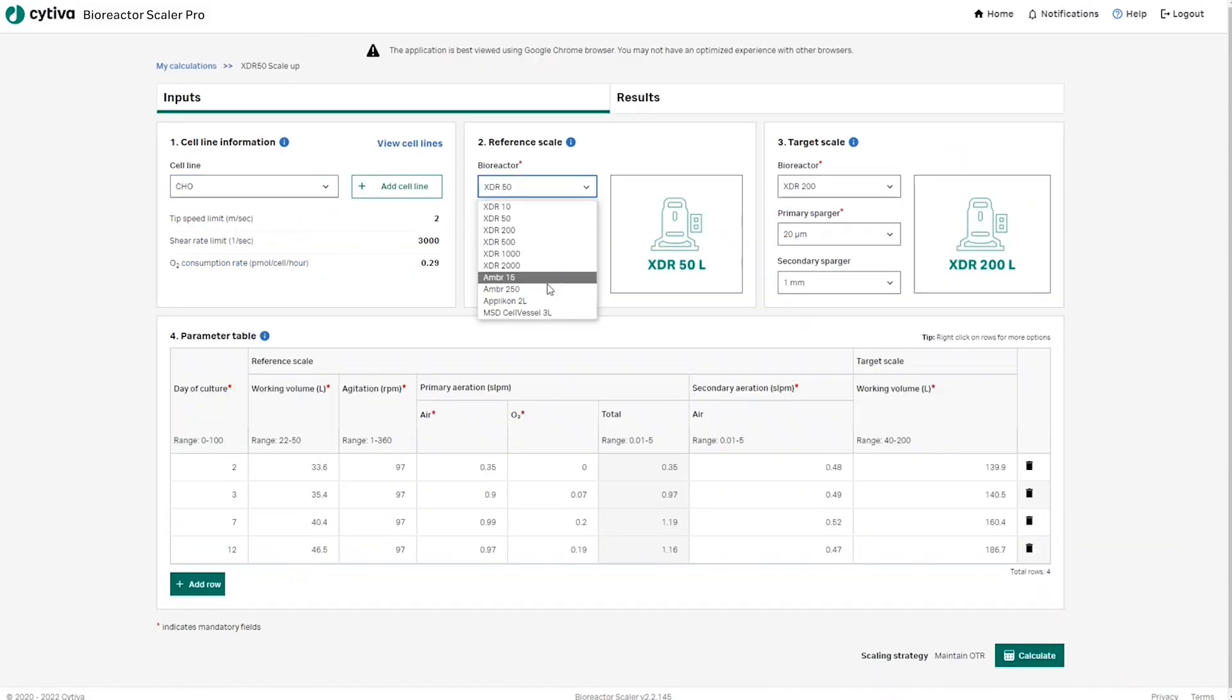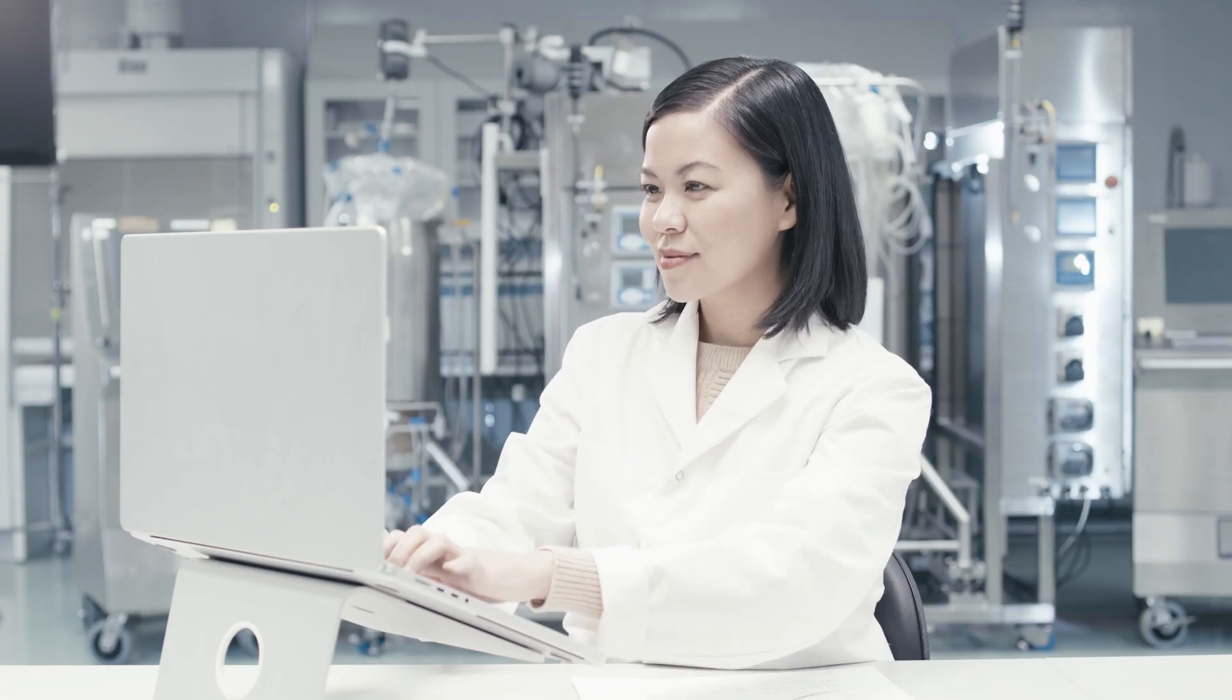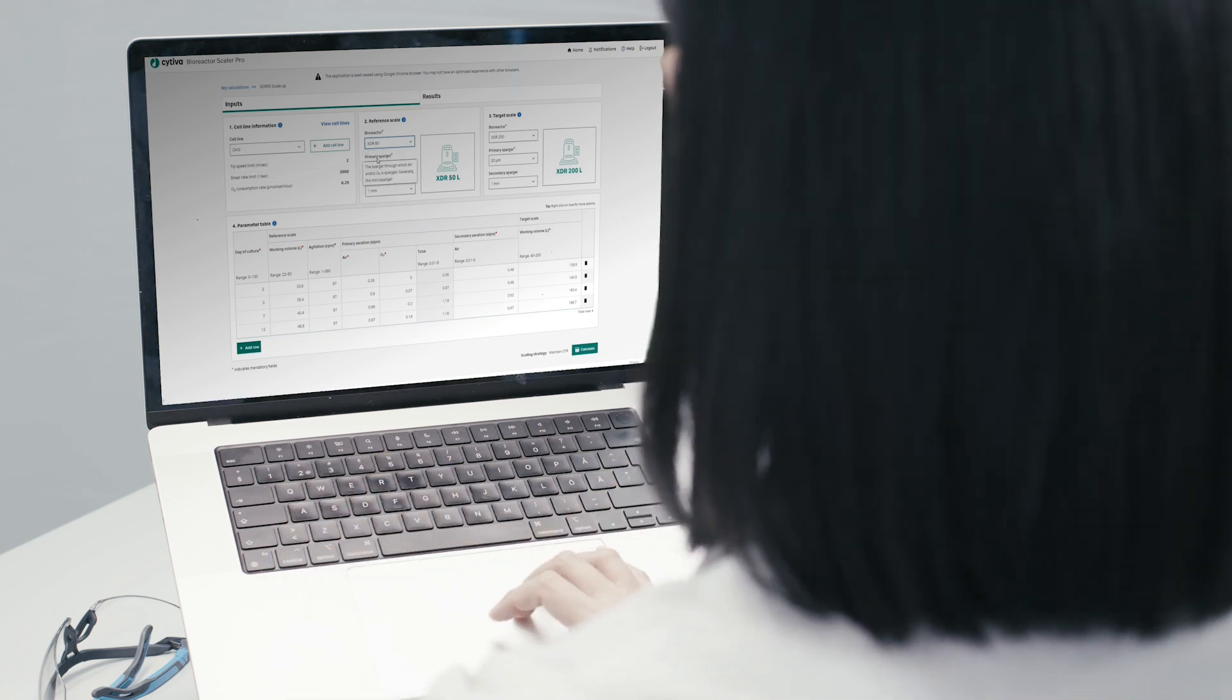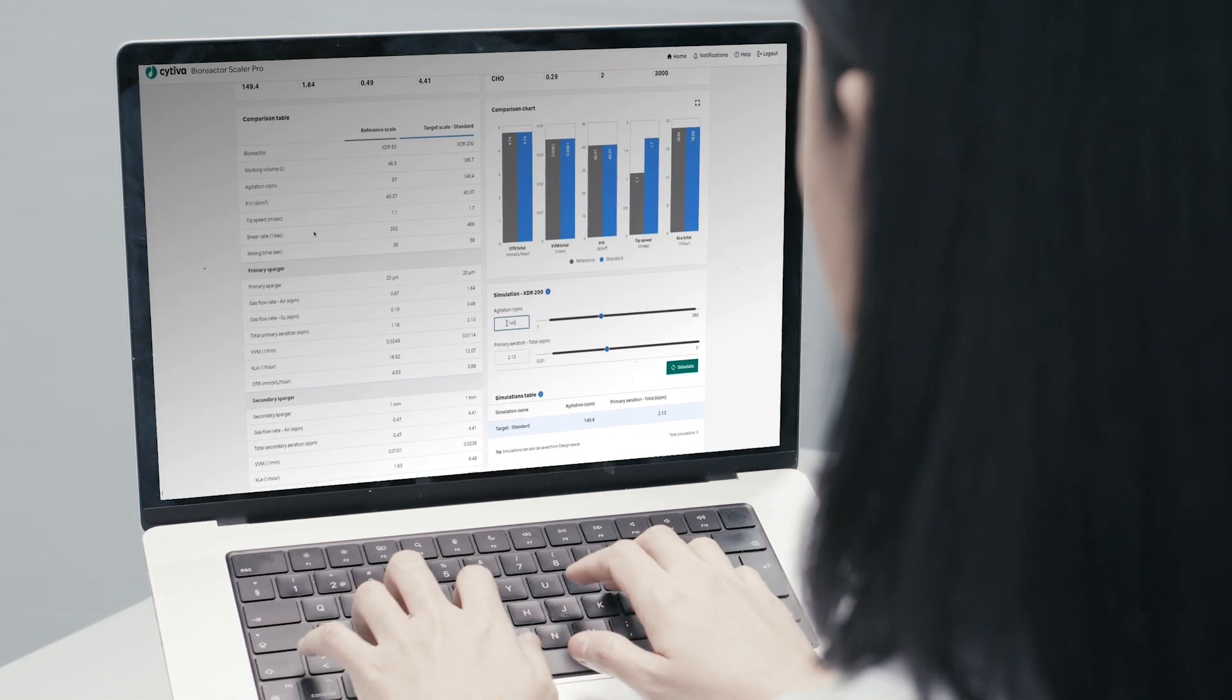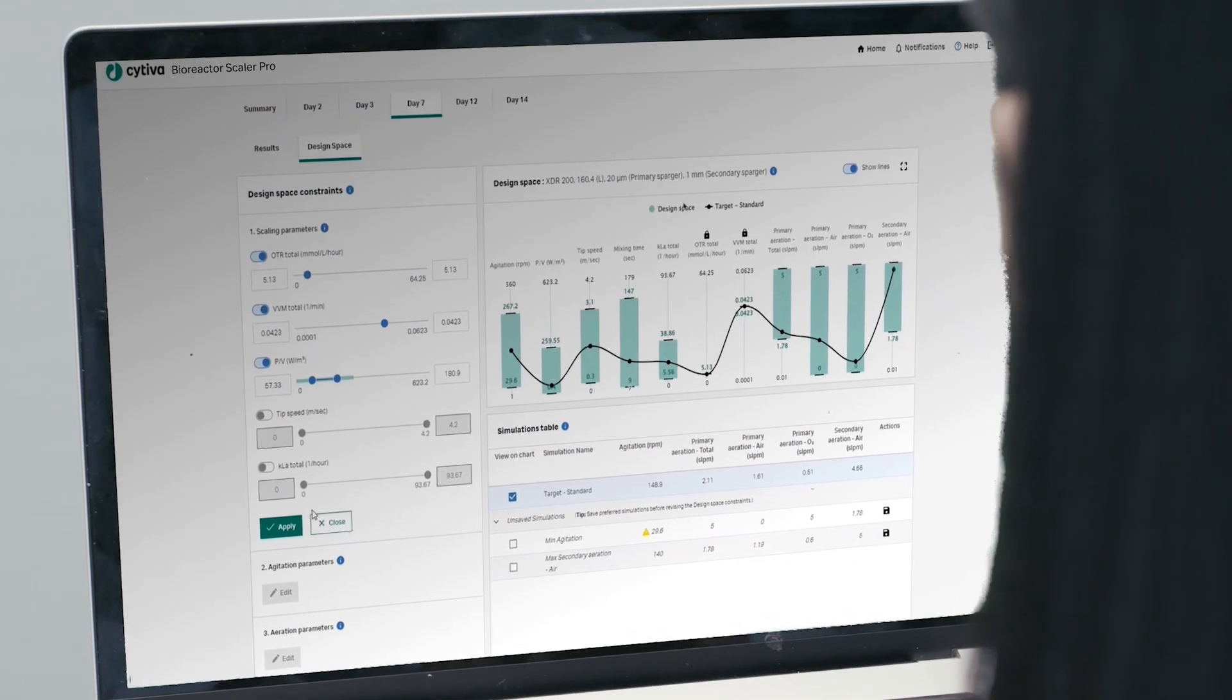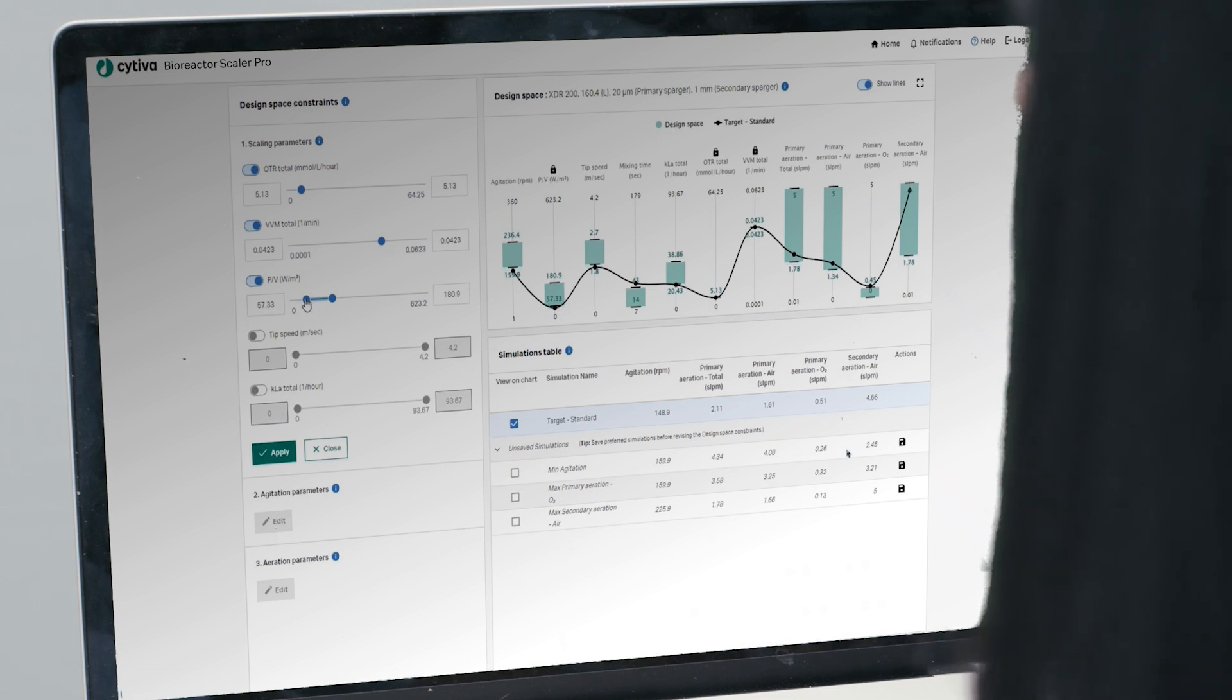Instead of the traditional multiple trial and error experiments based on your calculations, discover the possibilities with Scaler Pro simulations instead to better explore and optimize settings until an optimal experiment design is determined. You can also better identify the design space you have to work with for your bioreactor parameters to achieve speed by fewer costly intermediate wet lab experiments and batches at scale.